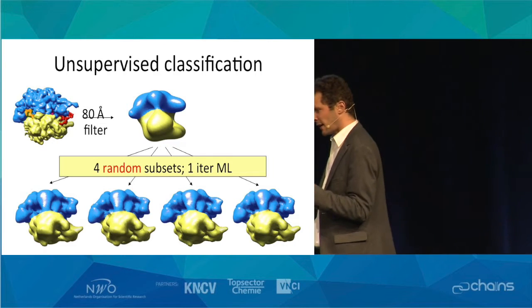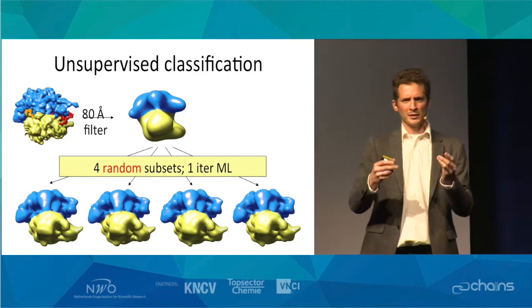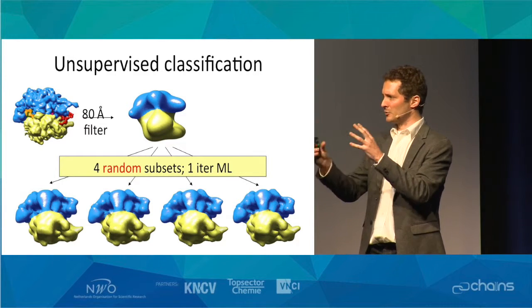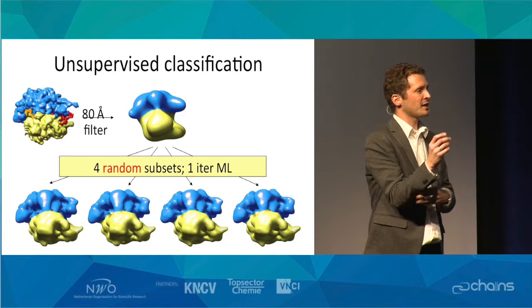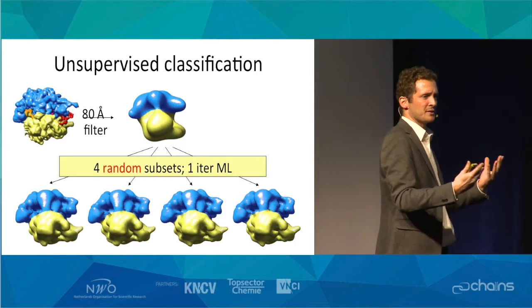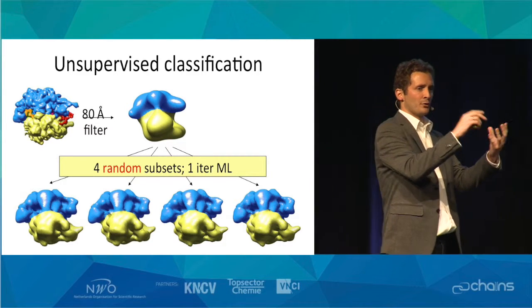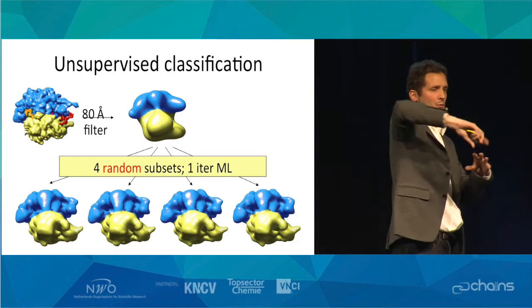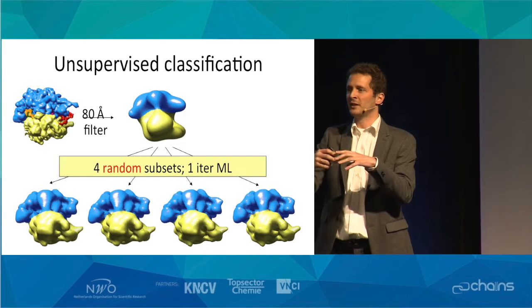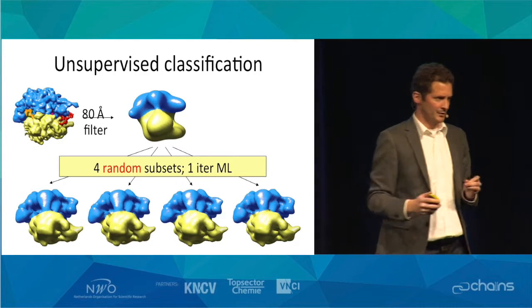Now, another, and that's the second aspect of image processing development that I'd like to discuss with you, is the fact that all these protein complexes, they're really like macromolecular machines. So they use movement of their individual domains relative to each other, lever motions, rotations, etc., as a critical way of how they actually work. And if these machines do that at the moment that we freeze them, then you'll end up with three-dimensional objects which are all different because they're in different states. A lever arm might swing around, or an axis might be in different rotational states. And if you would do a single reconstruction of all of those together, then the moving parts would all be blurred out. Now, and this is work already started when I was in Madrid in 2006.